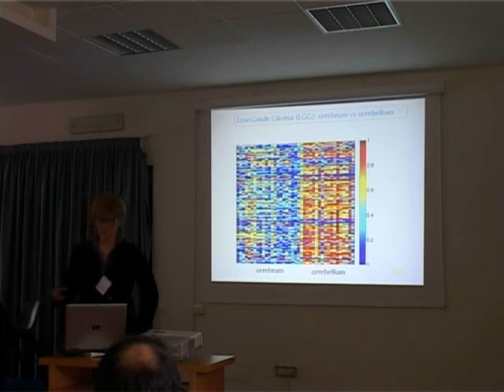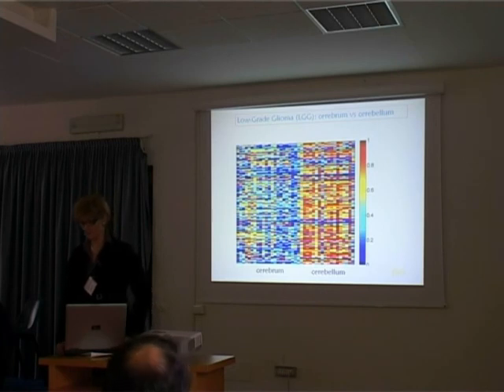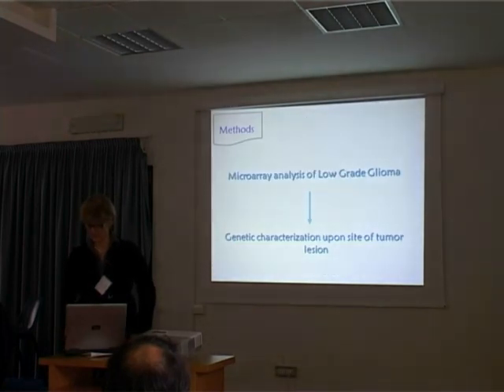So it's a long process, coming from a huge group of expression studies on a large group of genes. At the end, we will probably be analyzing 22 genes using quantitative PCR, and now Samantha will present to us.